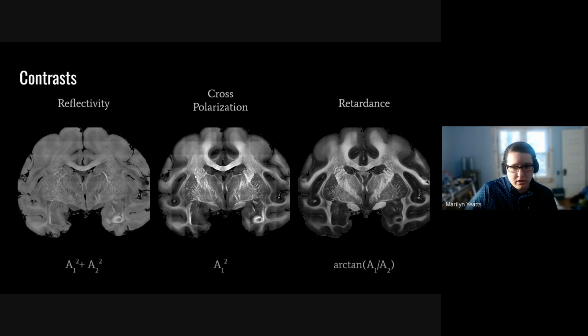that you can see. One that you can see very clearly in this reflectivity is this right here. That's actually a blood vessel that's come up through the thalamus and didn't cut properly with the compressome because they're hollow and they tend to just smush out of the way instead of cut. It can be a bit difficult to get them to cut in general with any technique. It's not dependent on this particular compressome.